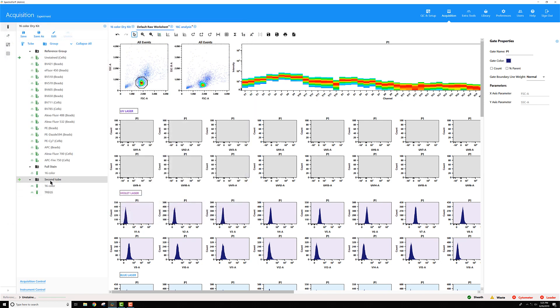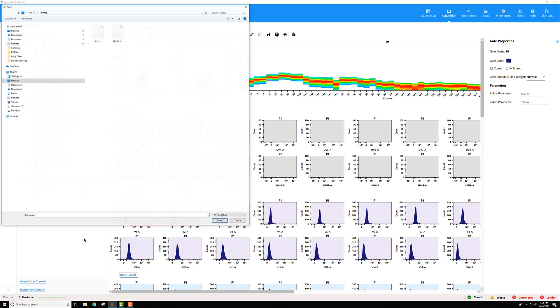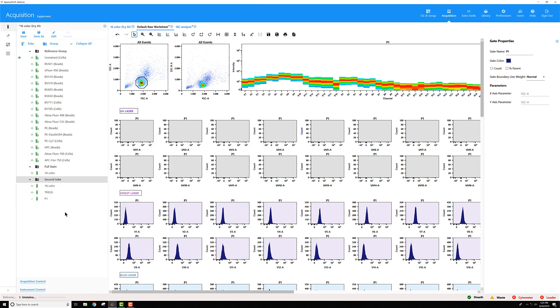Same idea, if I want to import that file back in, I can right-click on the group and select Import FCS File, choose my exported file, bring it back to the experiment, and you can see by the check mark here, this FCS file has raw data only. It doesn't have unmixed file data.